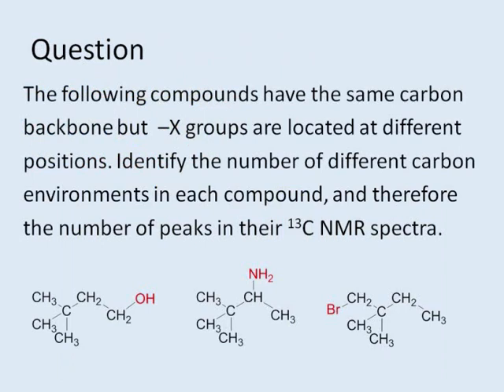The following compounds have the same carbon backbone, but the X substituents are located at different positions. Identify the number of different carbon environments in each compound, and therefore the number of peaks in their carbon-13 NMR spectra.